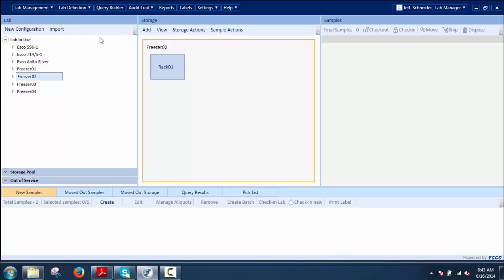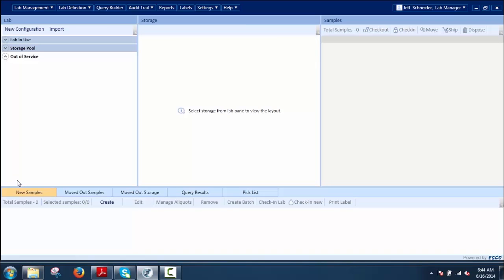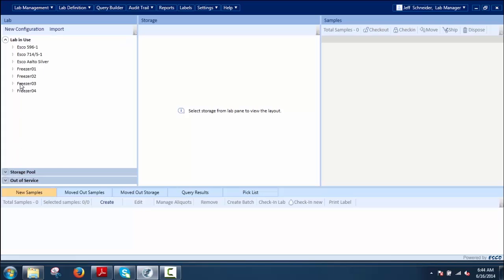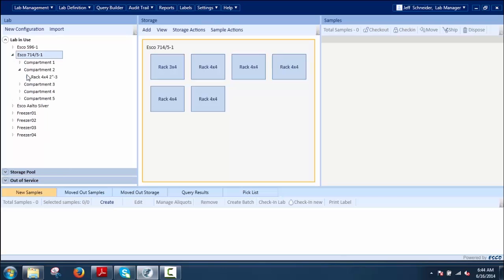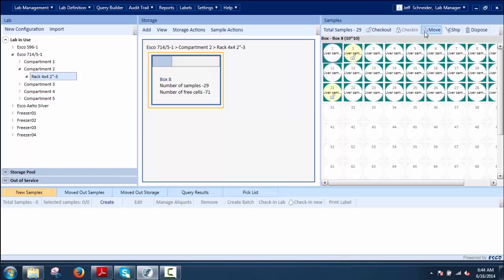Under Storages and Samples, it displays all storages in the lab and samples within those storages. It gives a view of all storages which are in use, in inventory, and out of service. This is where the user can create new samples and perform operations on them. The user can perform actions on the sample of interest conveniently as the samples will be visible for the selected storage.